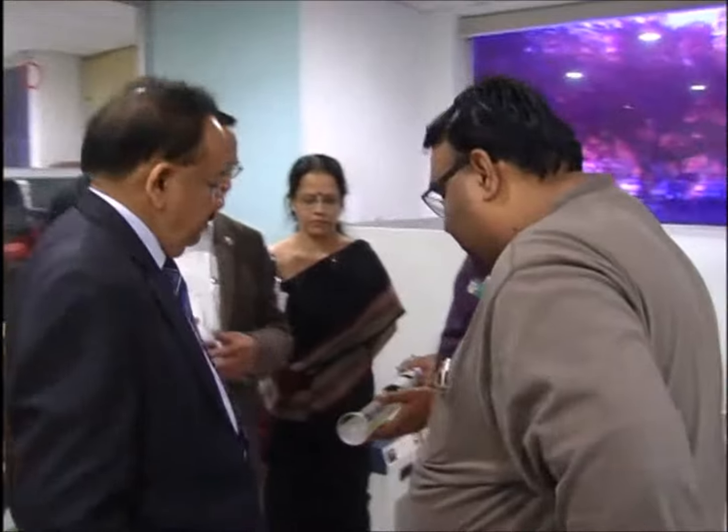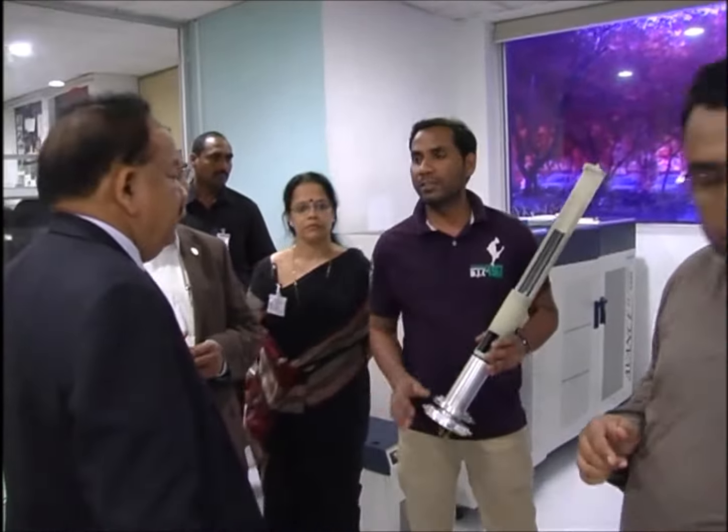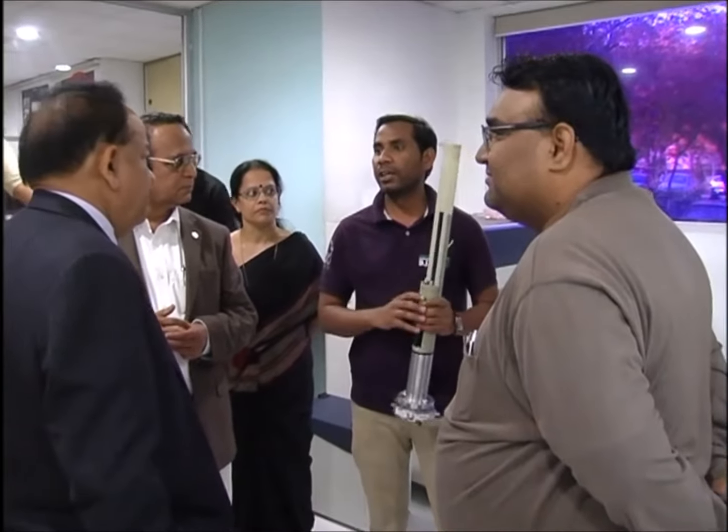We can put the radiation right here, and after that we put this probe inside, and when it comes, this NMR spectrum is nothing but the spectrum we take from protons. So what is it? Mainly protons. Depending on the NMR case, the distribution of protons will be different. According to that, we will get different kinds of things.